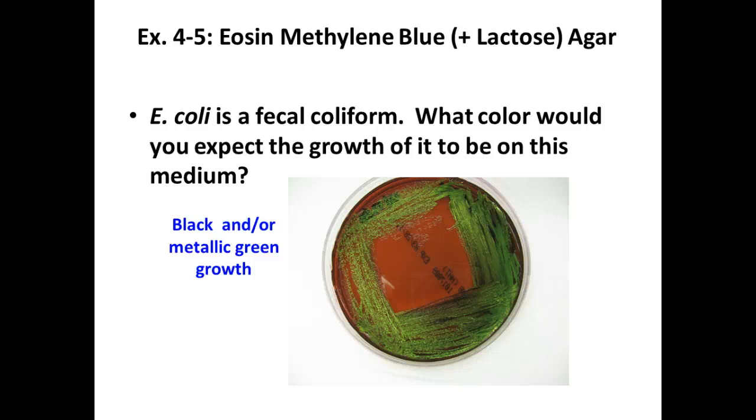Because of the interaction of the acids with these dyes. It's really pretty. So you should very easily be able to find it on that plate that I had for you guys, right? If you flip it over and actually look at the side where you see them growing, don't look at the bottom of the plate, look through the lid. Or lift up the lid if you need to, if there's condensation. You guys see that nice, pretty metallic green on that plate?